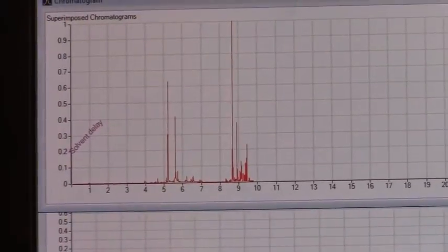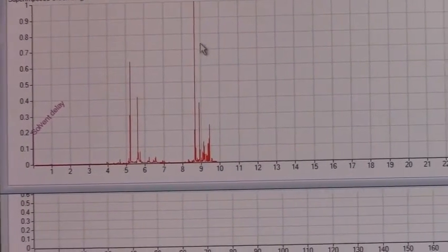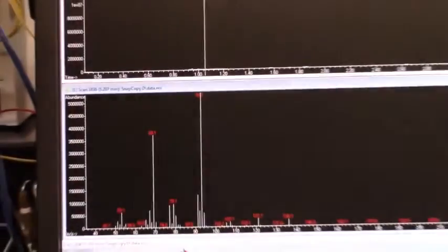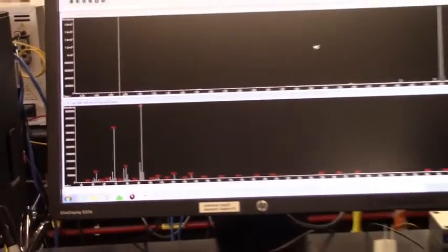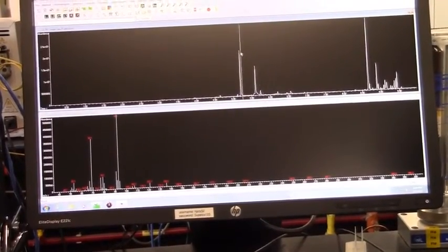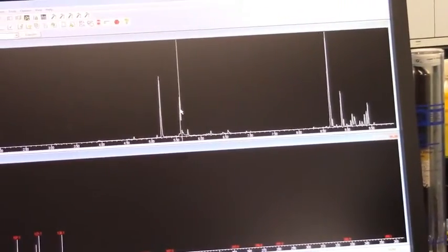All right, so now we've got another cluster of terpenes that are eluting, and a rather large one, as you can see here. So I'm going to do the same thing again that I did before. I'm going to take a picture in real time. So there's our first 2 big terpenes that we saw. The first one we saw was myrcene. The second one, if we take a spectrum and do a search, is saying it is limonene. So you would expect to find something like that.